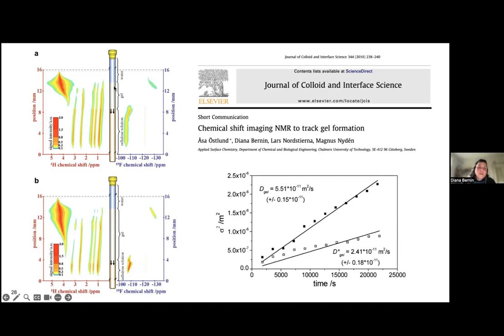But here we have a cellulose solution. And then we add water on top. Again, it's the same. It also coagulates cellulose. And then you record these 2D sequences, and you basically get spectra that are stacked. So each of these is a spectrum, but you can plot this in 2D mode and it's the intensity that you see here. So then you have water here, and here you have the cellulose peaks, and then you can do the same for the fluorine. This was 2 different experiments.